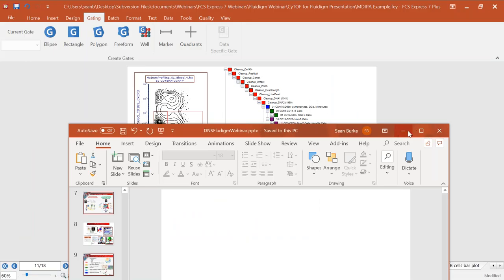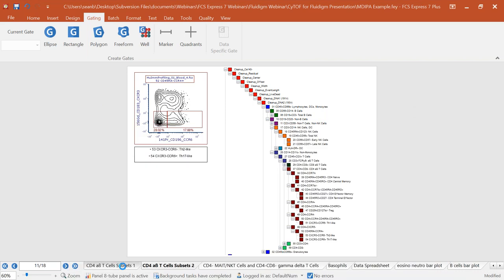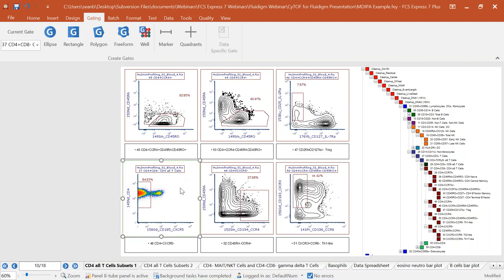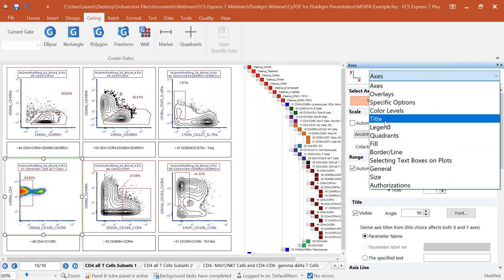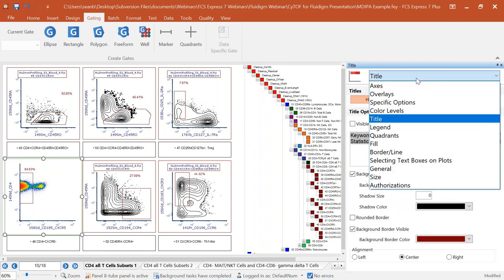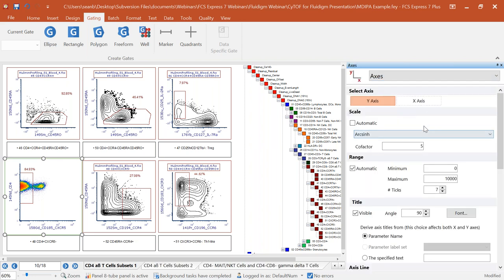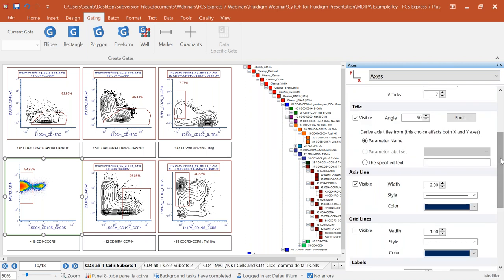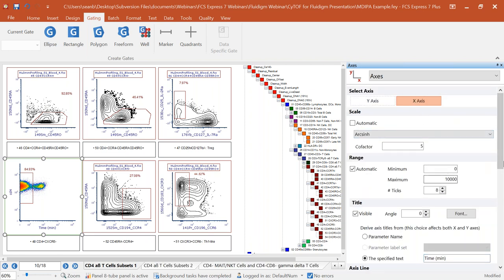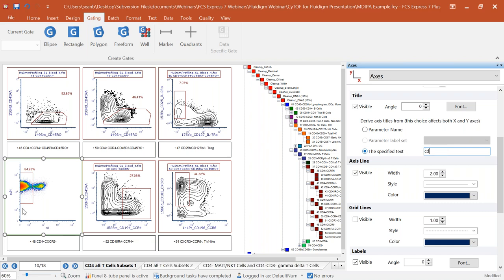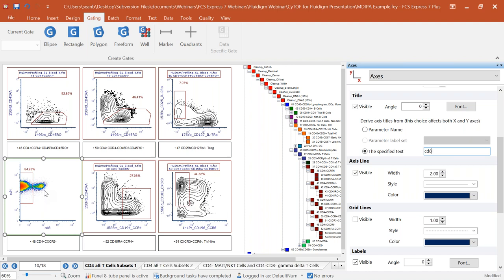You can do all formatting directly in FCS Express as well. There's a live-updating formatting interface: right-click on any plot, choose format, and change anything about that plot. If you don't want to show the title, you can remove it. If you want a custom axis label instead of 'CD4 145ND,' you can enter any text you want. All formatting can be done in FCS Express before you export anywhere.